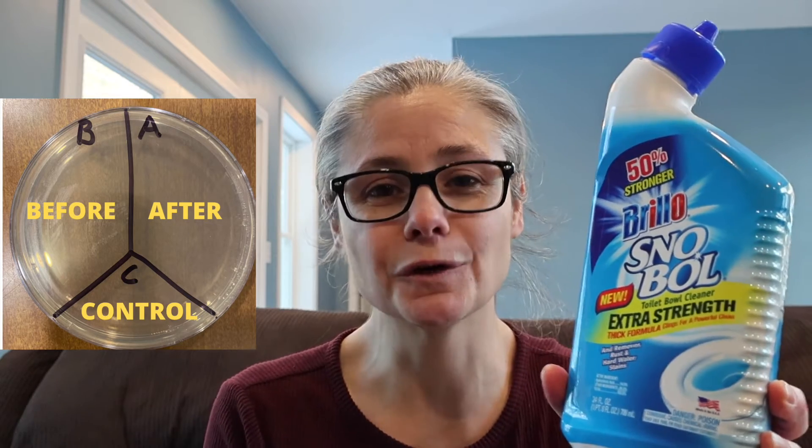But we're still going to test it to see, because Michelle was wondering. In order to test how well the Snowbowl works, I'm going to take a petri dish and label it A, B, and C. I'm going to take some sterile swabs and swab my toilet bowl. I'll place that sample in the section labeled B for before, then clean according to the Snowbowl directions, sample again, and place that sample in section A for after. C is my control — nothing's going to go there.